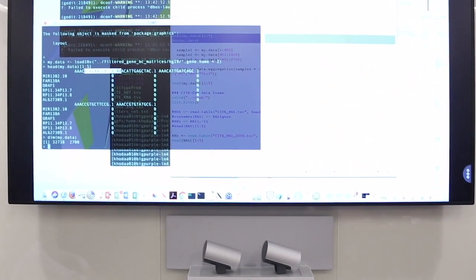So yeah, once you load the data, you first load the RNA-seq data, and then you would load the ADTs later. This is just generally how it looks. I'm just printing the head of the data and the first 5 columns. So here you have the genes, and here the cells, right?